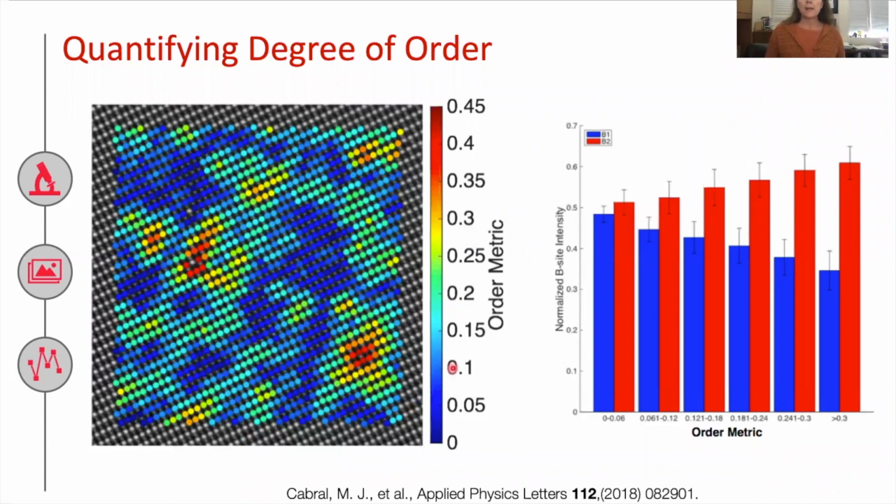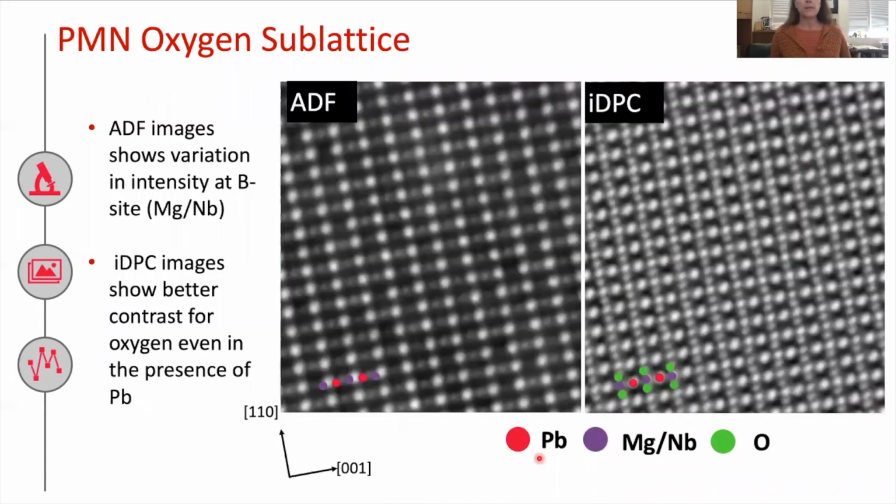And we've done that and put it on a scale where the highest intensity, we have the most ordering, where we have very strong oscillations between bright and dark 111 planes, and therefore very strong ordering between the niobium and the magnesium. And we see that we have really what we call a graded ordered structure out to the antiphase boundaries. And we think that this is a mechanism where it lowers the energy of the antiphase boundaries by having the order metric actually converge at the antiphase boundaries.